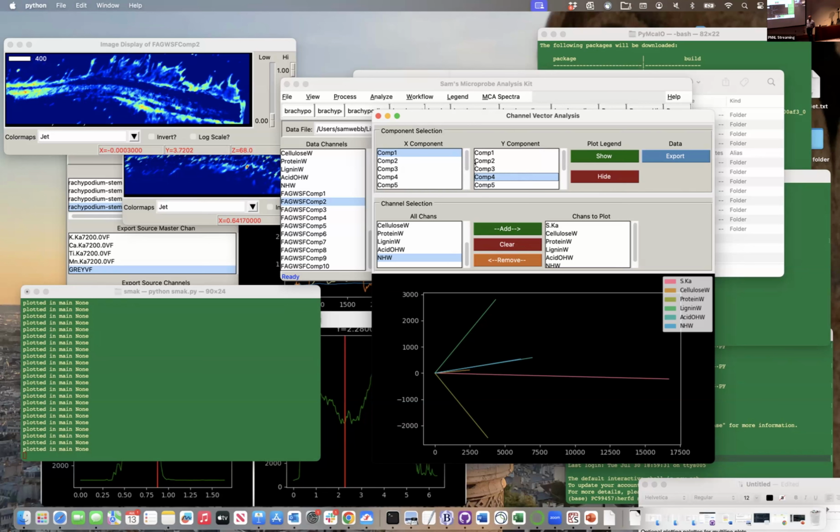Another aspect is the complete moving around of the sample between the different modes of data that we collected. The warping definitely helps to accommodate that, but it's not perfect. The infrared was beautiful because all the hyphae were fresh. In the X-ray data, the hyphae had kind of collapsed, so they were all squished together.